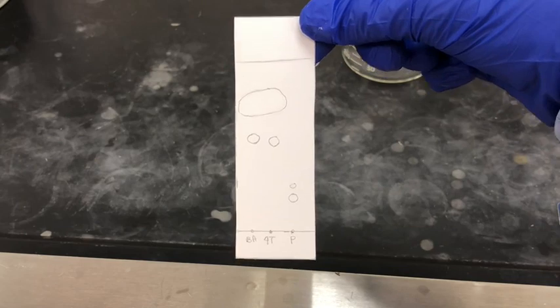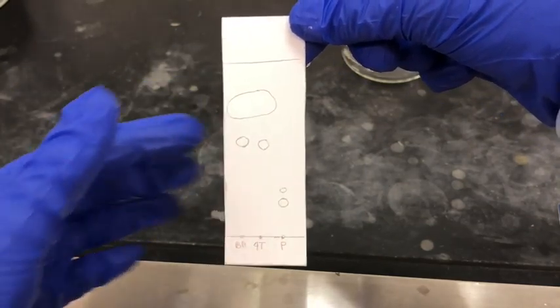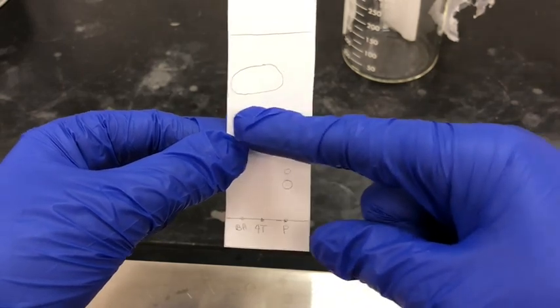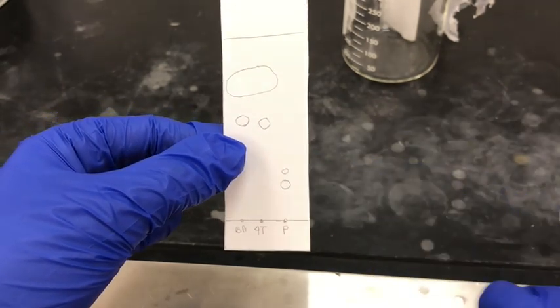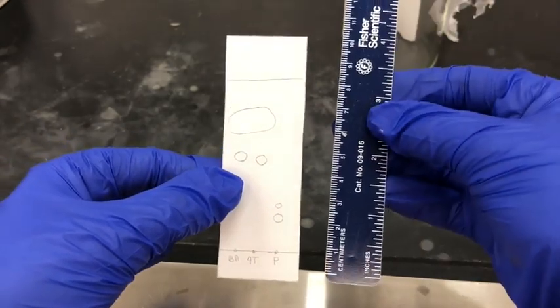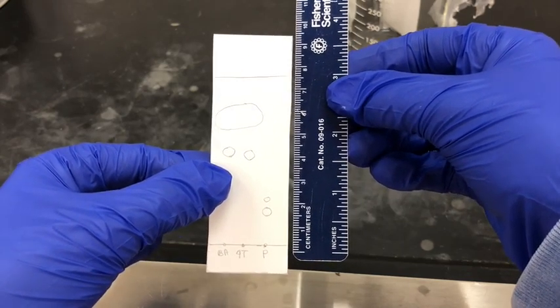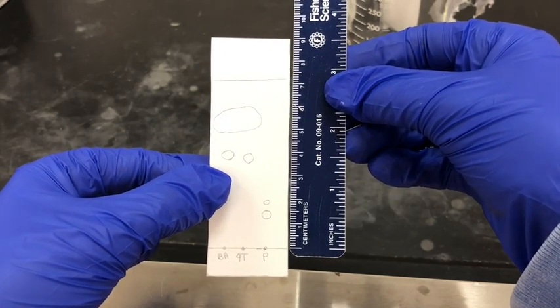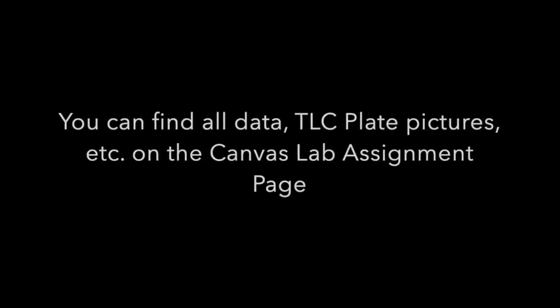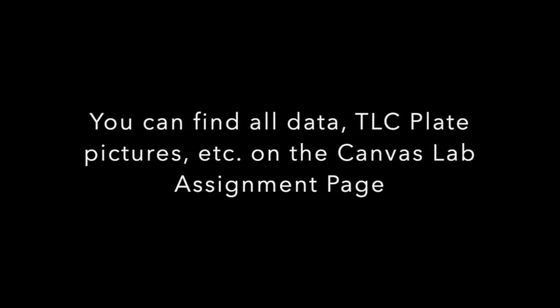Here are my pencil markings showing where all of the spots were on the plate. The reactants traveled pretty far up the plate and I might have oversaturated them, while the product on the right did not travel as far. Comparing these two, we can see a pretty big difference between the reactants and the products, which is a good sign. I'll post a picture of the TLC plate next to a ruler and you'll measure the distance each dot traveled and calculate RF values, or retention factors — you can find how to do that in the Zubrick lab manual. That's the end of the lab — you can find all of the data, pictures, and post-lab questions on the Canvas lab assignment page. Good luck and let me know if you have any questions.